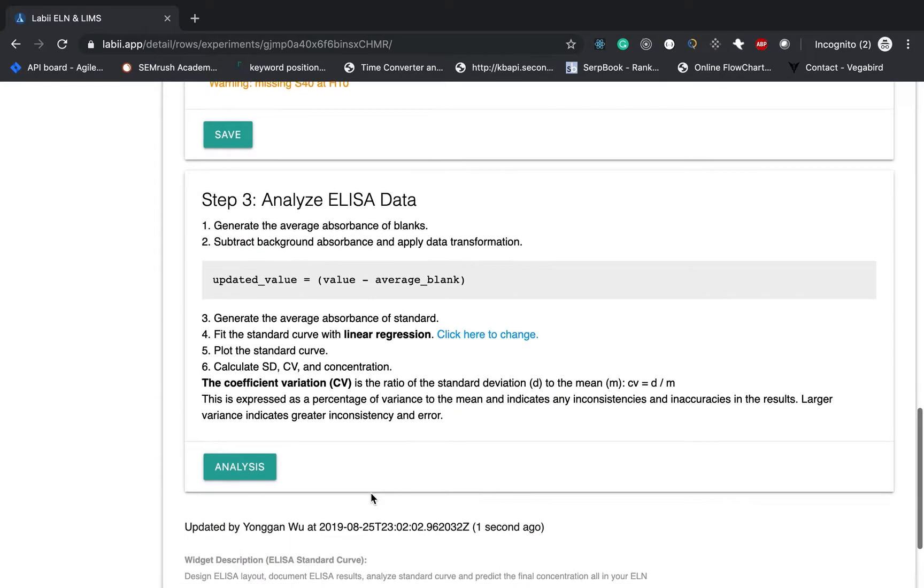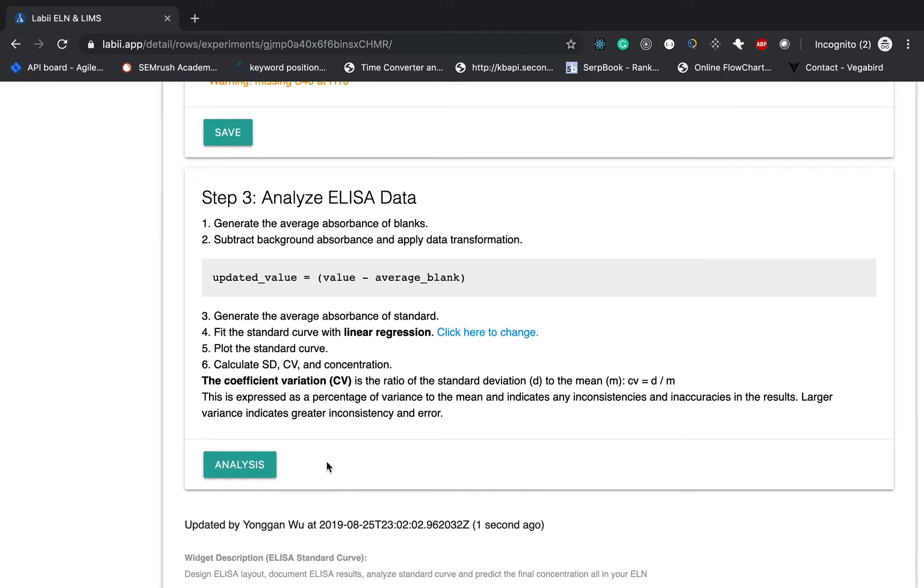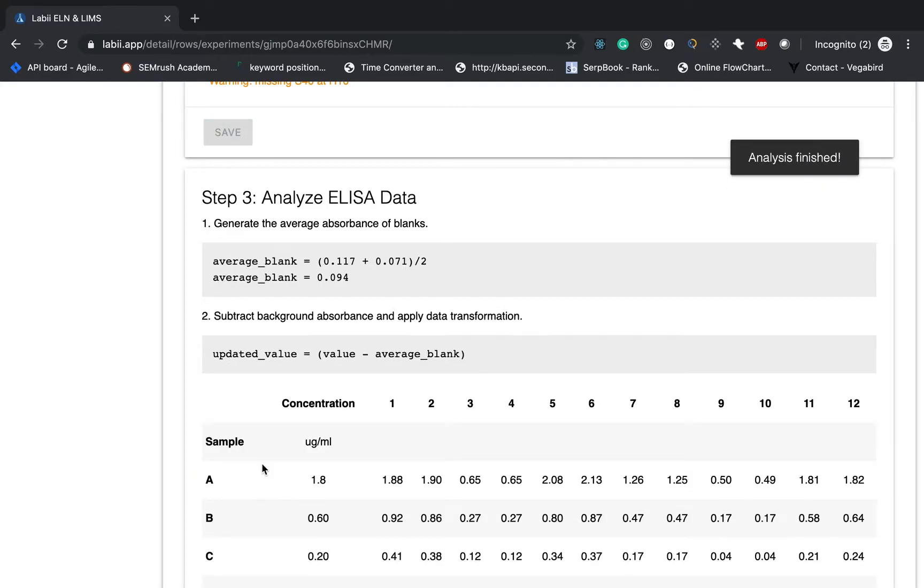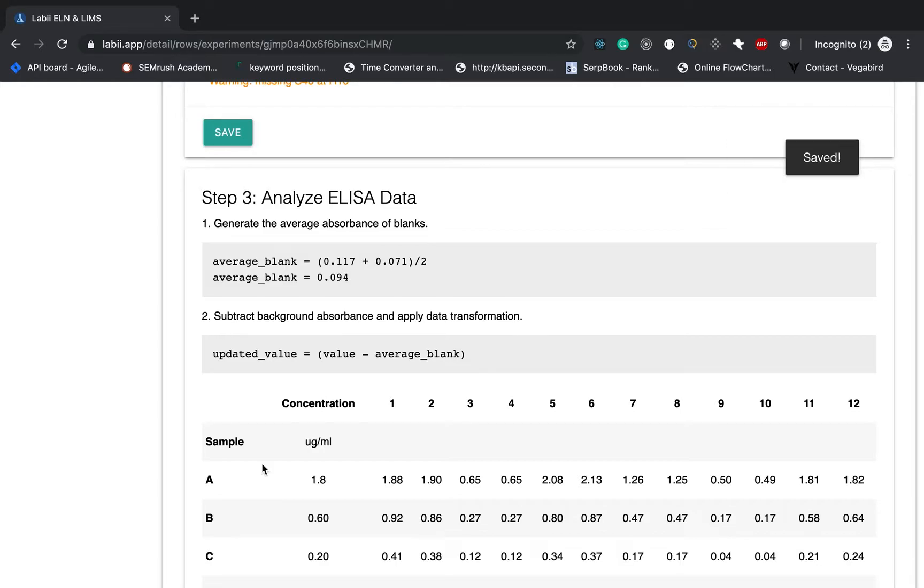And then the last step is perform data analysis. It's as simple as click the analysis button. I will just click this button. The analysis should be done in one or two seconds. And the final result is being saved.